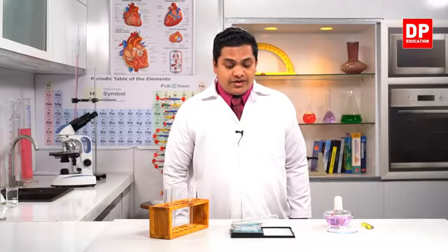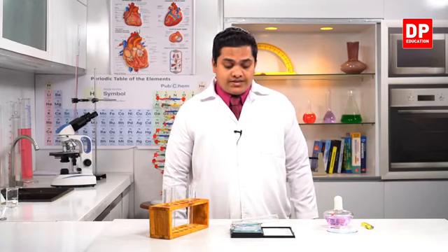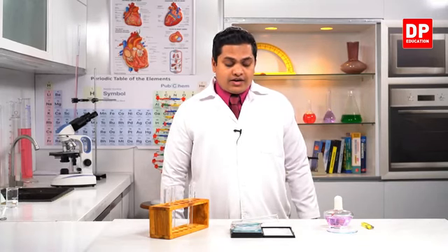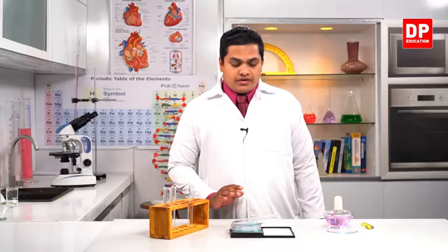That's why I told you it's very sensitive. So we have to keep all the systems very steady. Otherwise the mass will reduce or increase, and we can't get a clear observation. So the final value of the digital balance is now 29.62 grams. You can observe it on the screen here. It's been printed 29.62, right?